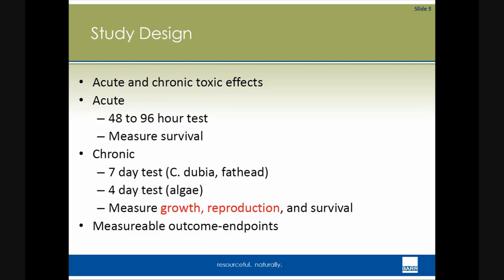Whereas chronic testing is done over a longer exposure period, and it simulates perhaps the tail end of a storm event, which is more applicable to maybe deicing products as they go into the environment, where you may have a short-term runoff effect, which would be acute, whereas the longer-term period would be more chronic, as the chemicals wash off the road and finally lead into the waterway.